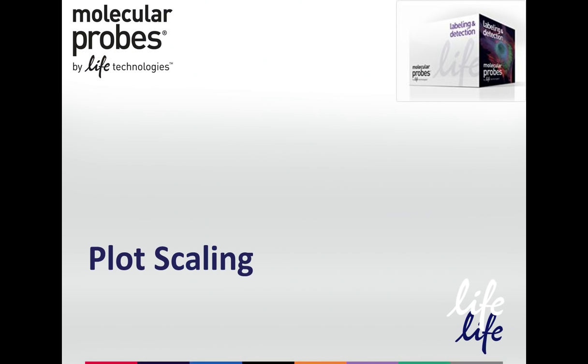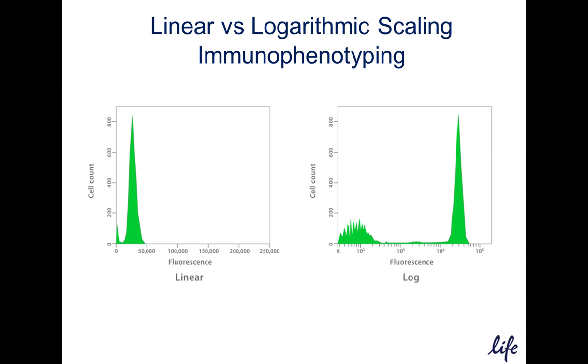So now, let's shift to a discussion of scaling of plots. Once data has been collected, we can use histograms or dot plots to graphically represent the data. Each of these plots can be generated using linear scaling or using logarithmic scaling, also called log scaling.